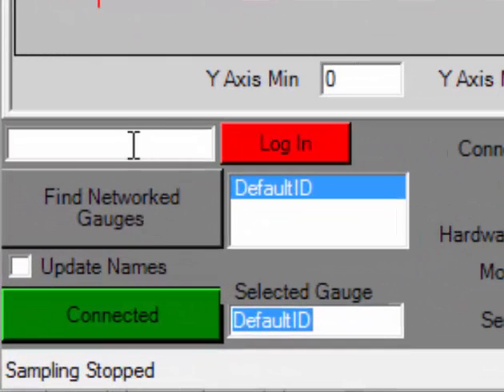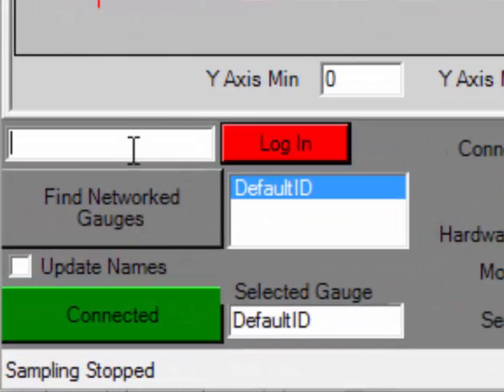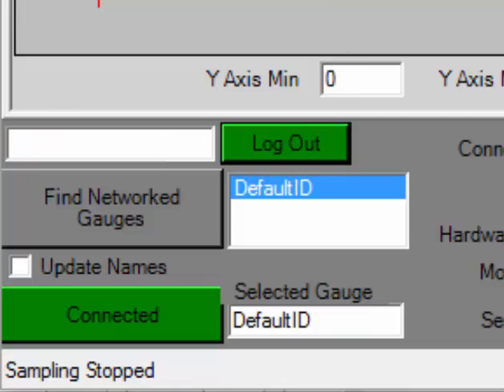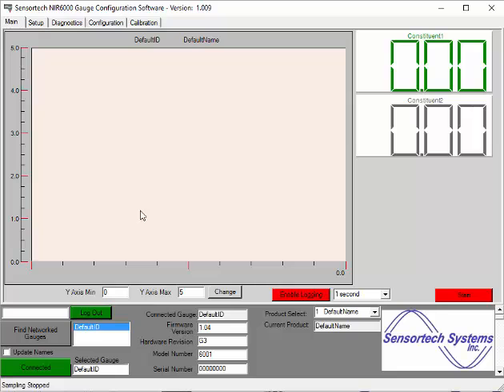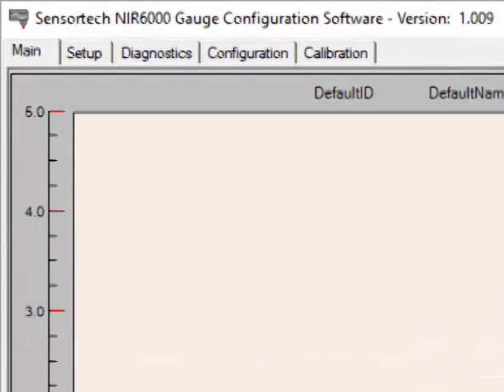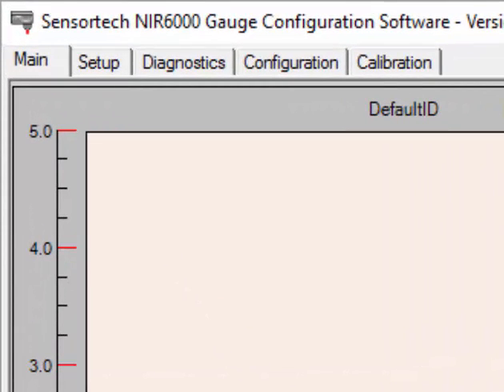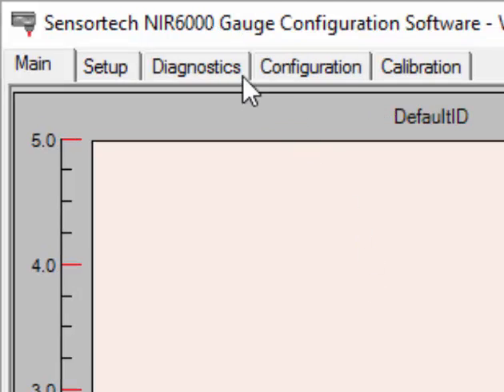Next, you will want to log in using your engineering password. Enter the password in the field to the left of the red Login button and select the button to log in. If successful, you will see the red Login button turn green and display the text Logout. Once logged in, you will see the Configuration and Calibration tabs appear towards the top of the application.